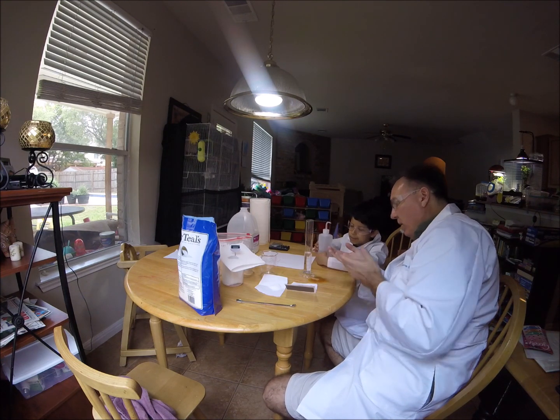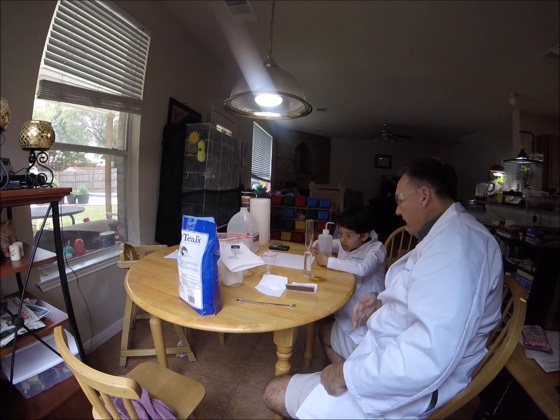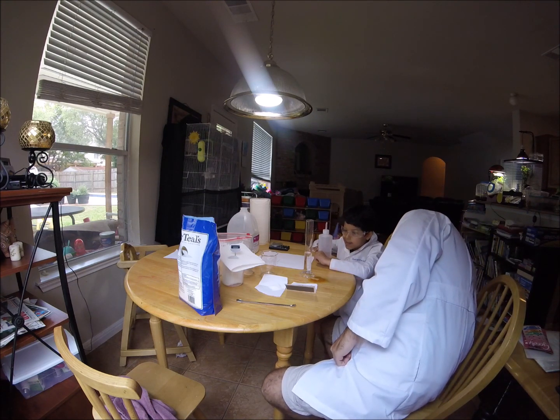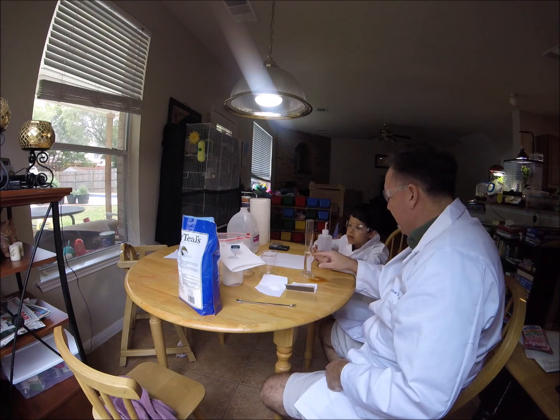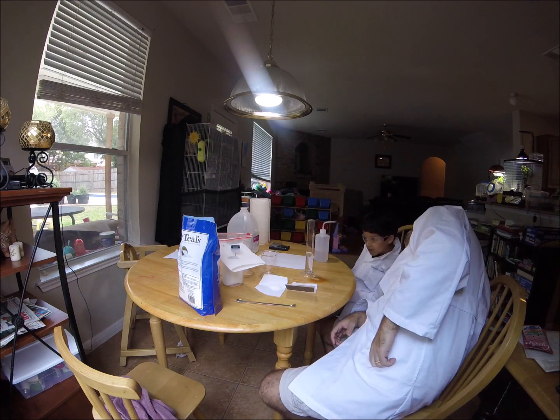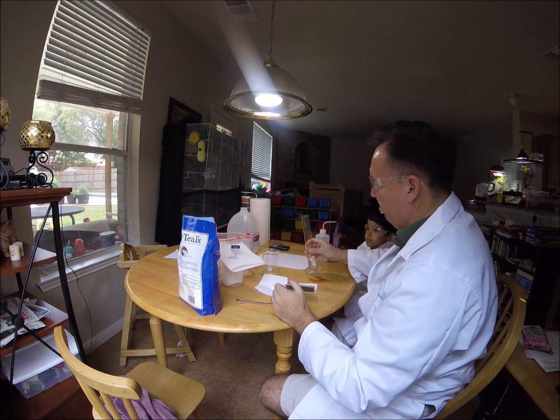You notice how the water curves up at the edges of the cylinder? And it's at a low point in the middle of the cylinder? We want that low point to read exactly 50 — not at the edge, but in the middle of the cylinder. That's called the meniscus. Is that 50? Looks perfect. So let's put that in this cup here.